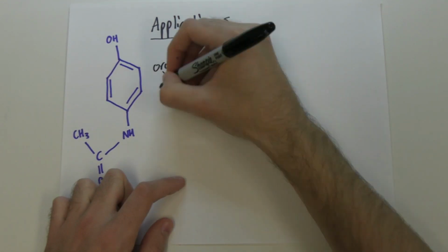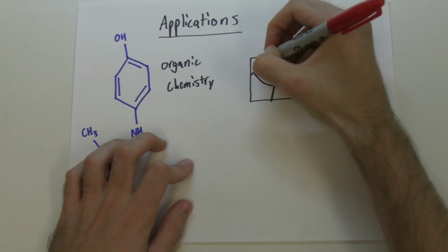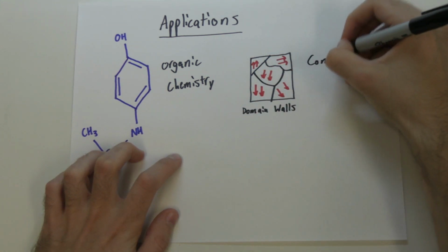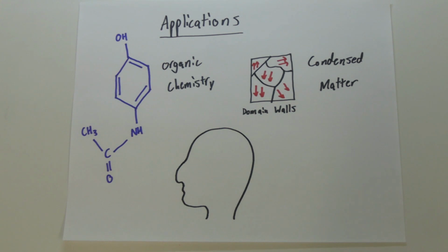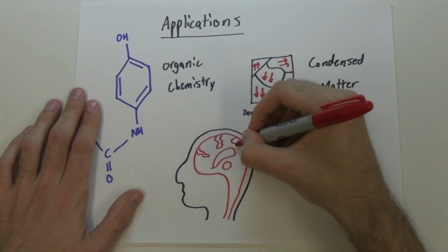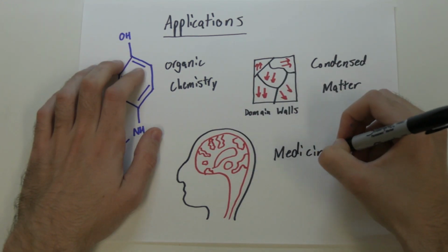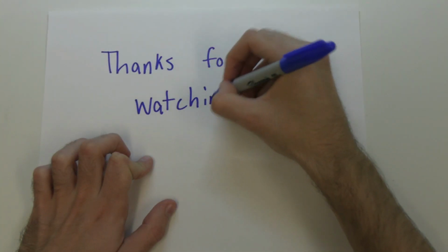As we saw in our examples, NMR can be very important in the analysis of organic chemistry for identifying and mapping molecular structures. Owing to its fundamental connection with magnetic and atomic physics, NMR has even found a place in condensed matter experiment. And, back to what we began with, NMR is the basis by which MRIs can look inside your body using very strong magnetic fields. So next time you wonder why you can't wear your earrings or jewelry into an MRI, you'll know the reason.